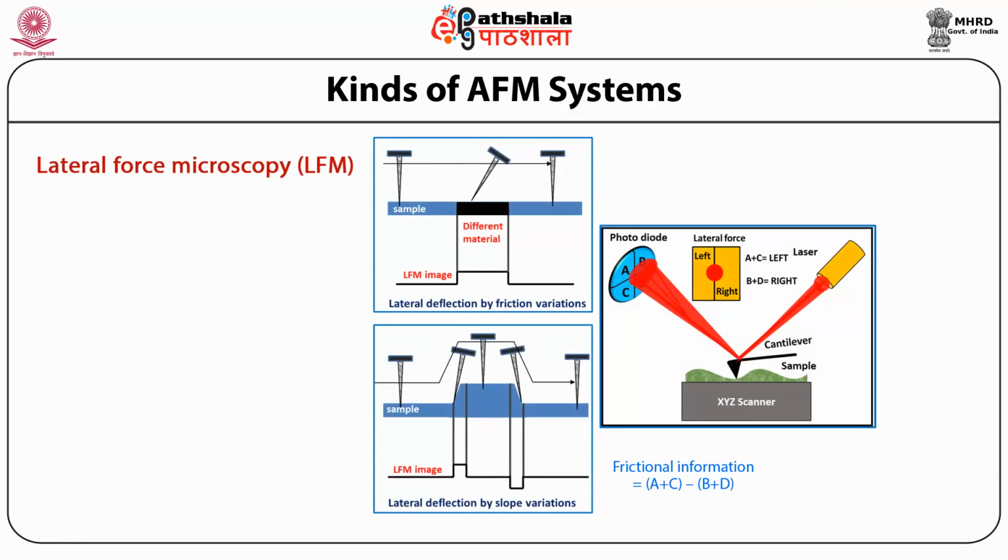Different kinds of AFM systems. First, let us see the lateral force mode, LFM.